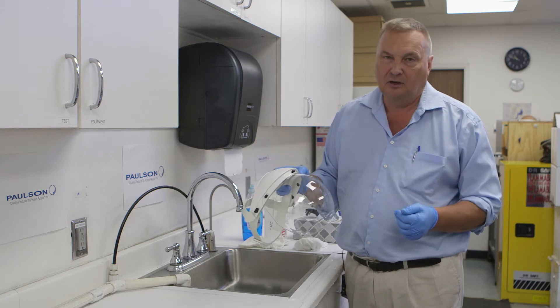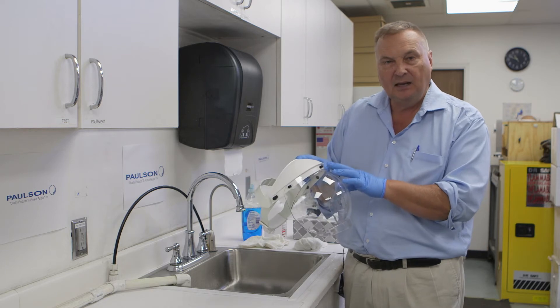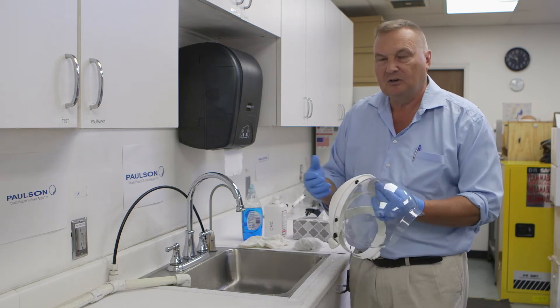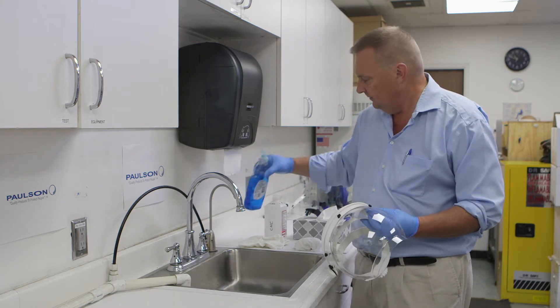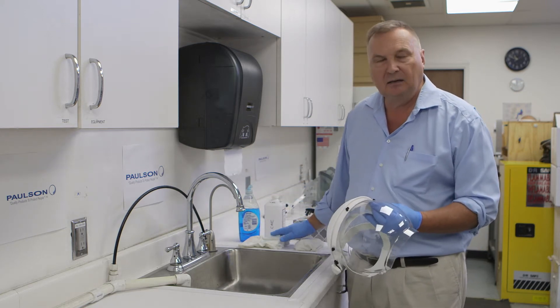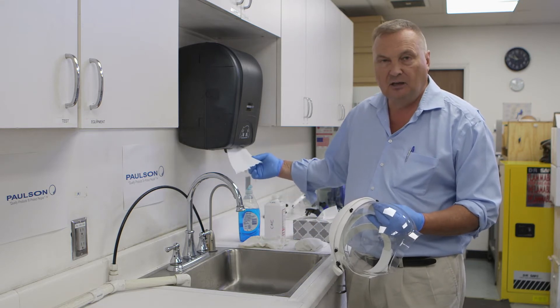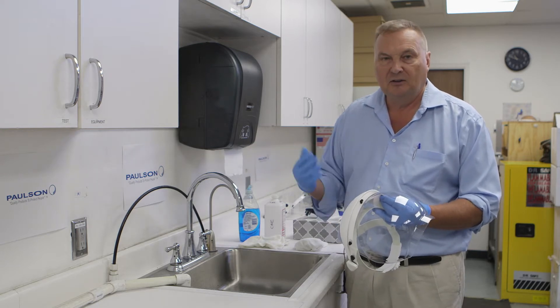This is used for protection in a variety of environments, besides the circumstance of the current COVID crisis. It needs to be occasionally cleaned and sanitized. You have to assemble your materials: dish detergent, 91% isopropyl alcohol, and clean cotton rags. I'm not suggesting paper toweling because it can scratch face shields due to coarse particles.